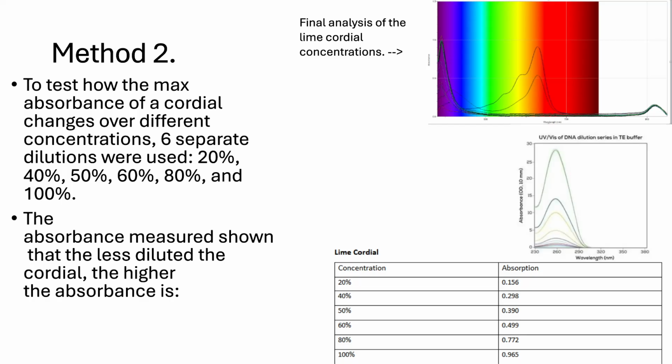and this spectra is from a company called Unchained Labs, and this shows how similar they can be, because despite this being a DNA dilution series, the peaks overlap each other. So I'm pretty certain the 2 peaks on the top right one that are in the center are anomalies caused by either bubbles or fingerprints.